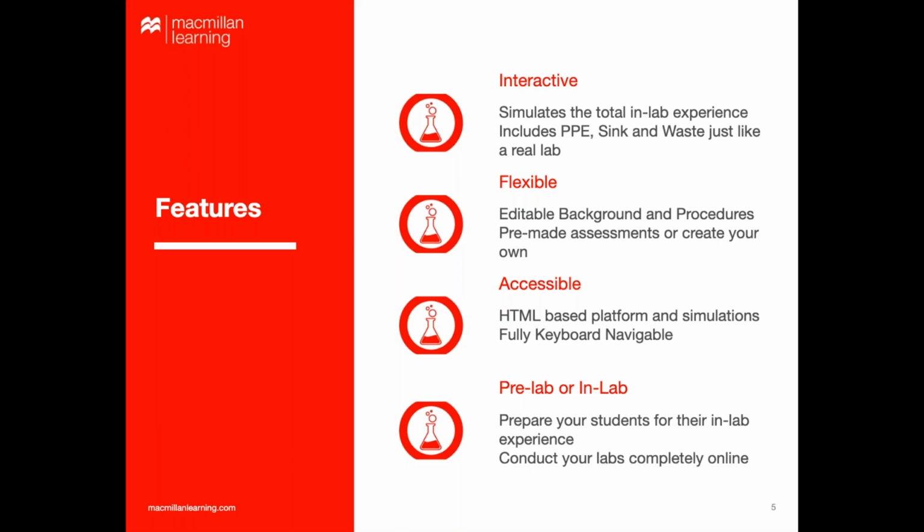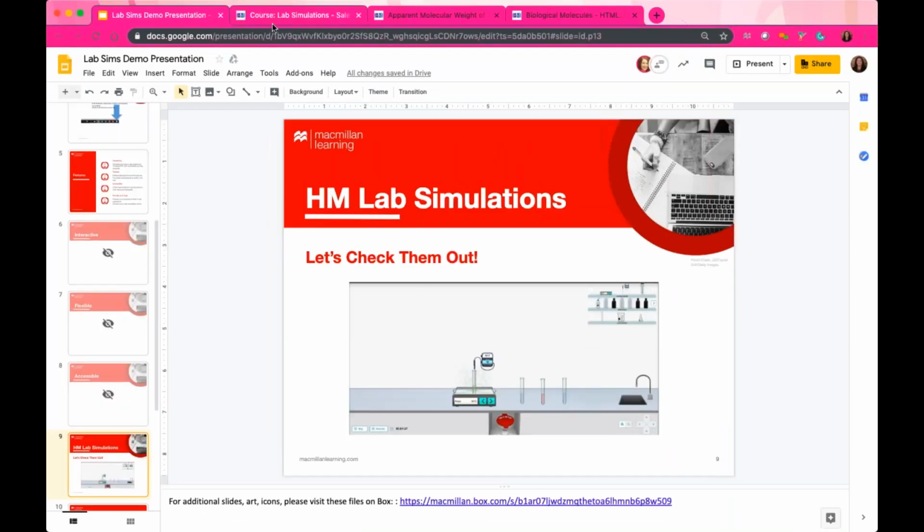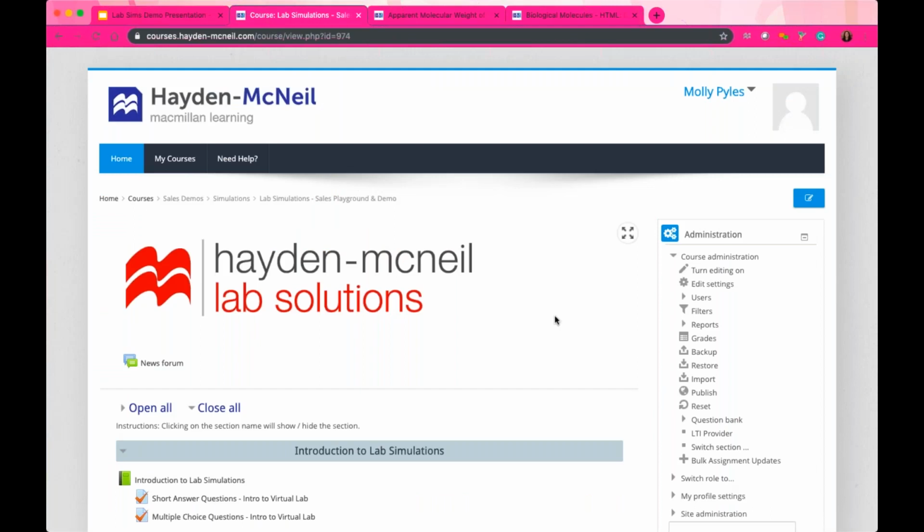And the last thing is that it is able to be used for many different scenarios, including both pre-lab and in-lab situations. So as a pre-lab, it could help prepare your students before they come to lab, or it could completely replace your lab experience if that needs to go online entirely. So we're going to actually dive into them pretty quickly here. This is just a screenshot of what these look like. And I have gone ahead and loaded that here.